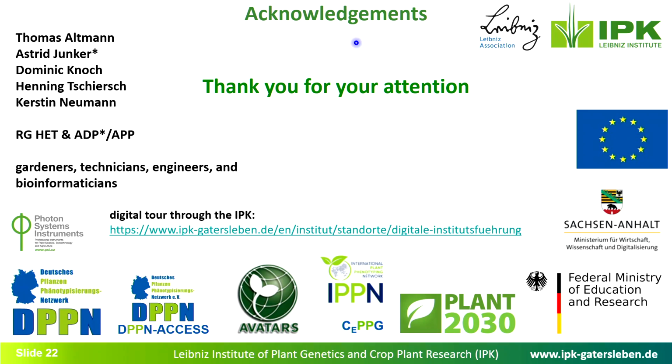But still, you can see that at least plant height and developmental speed were not affected by this little lack of percentage in light intensity. So your conclusion would be that it is more strict to consider the right temperature than to completely consider the right light intensity. From my experiments, I would say yes, that the light we applied here was basically sufficient, and the temperature component and the patterning of days had a much greater effect on the actual phenotype than the light.